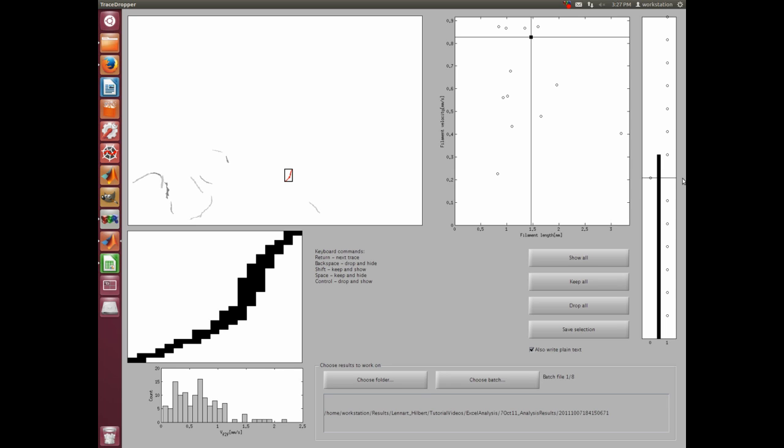And there's a bar going through it, meaning that it is hidden and has been scored. And there's also this long bar here, which basically is tracking our progress as we're going along. So this one here is now pointing to another filament, corresponding to the one which is selected here.